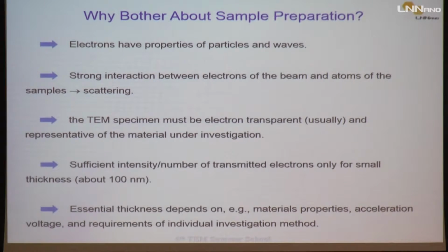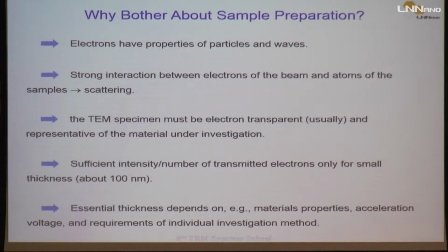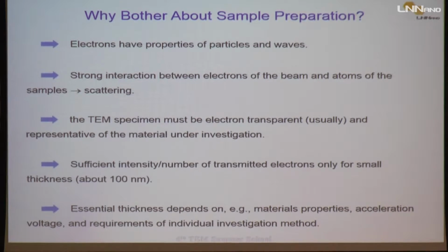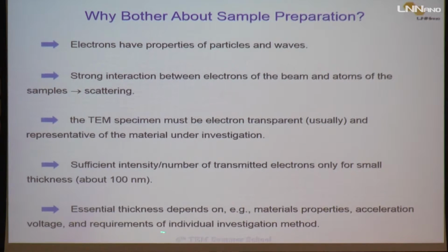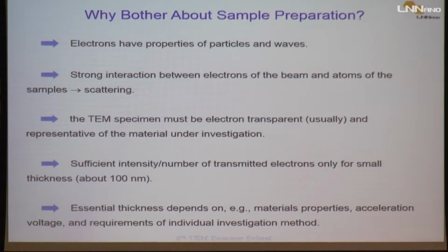The acceleration voltage of your machine: if you have a very high acceleration voltage, you have a deeper penetration of the electrons in the material. But on the other hand, if you have smaller acceleration, you have more scattering of the electrons. And the requirements for the investigation method that you plan to do with your sample.